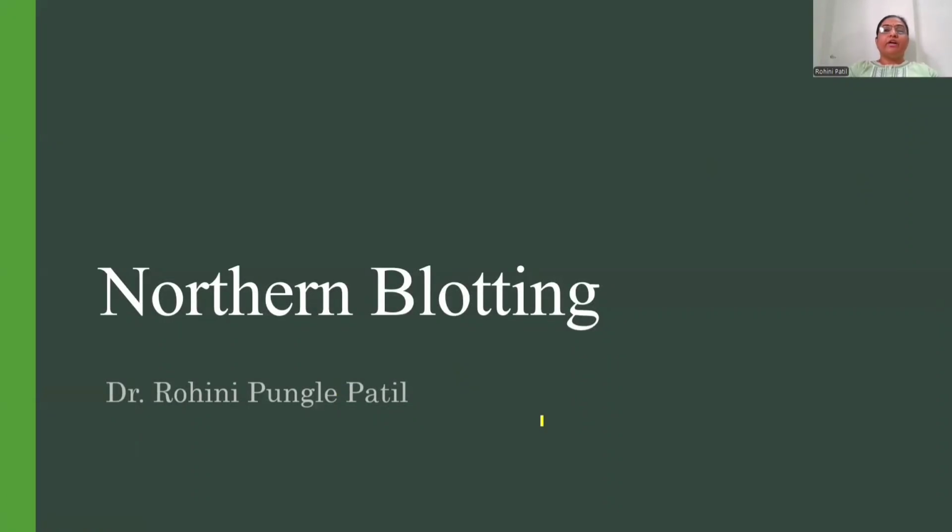Welcome. In the last video, we learned about the blotting techniques and also saw the Southern blot. Now, today we are going to learn about the Northern blot.